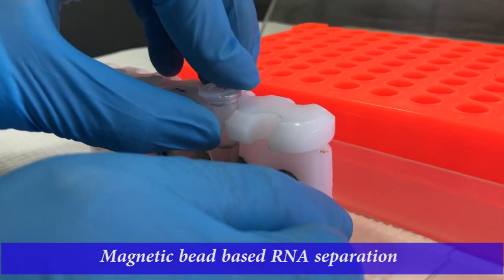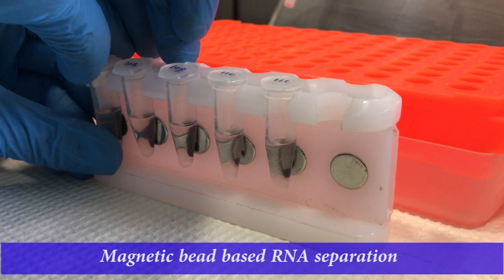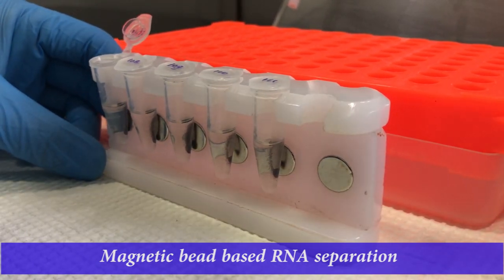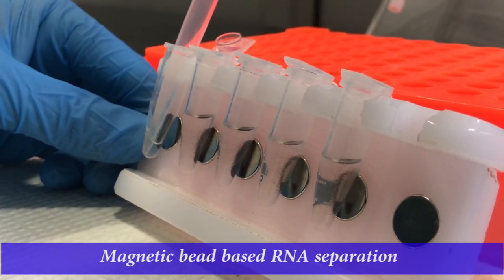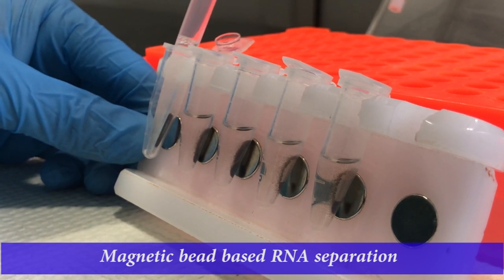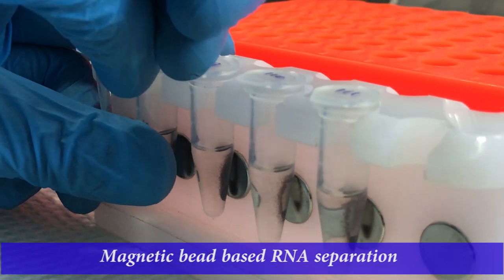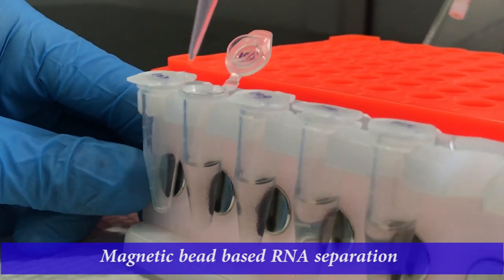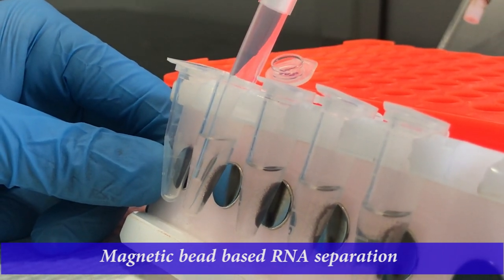Remove and discard the supernatant without disturbing the beads, which have the RNA. Place the tubes in the rack and resuspend the beads with 200 microliters of isopropanol. Repeat the steps of mixing of beads and separation on the magnetic stand as before.